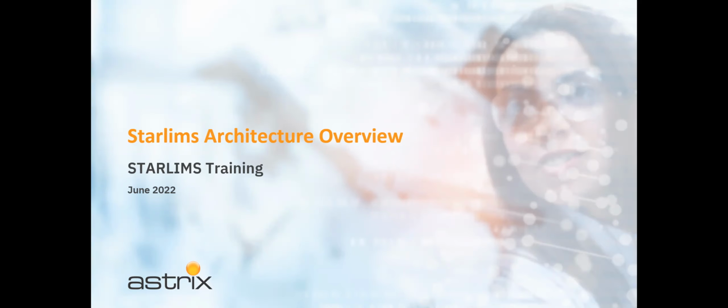The second part of today's training will have to do with the installation of the STARLIMS system, and we're going to take a short break between the two sessions. And I think we can probably cover this all in an hour and a half or so max. So if you'd like, please have your café con leches handy. So we're going to probably zoom pretty much through this. Since they're only 30 minutes long, we probably won't take a break in the middle of the session itself, the sessions, I should say.